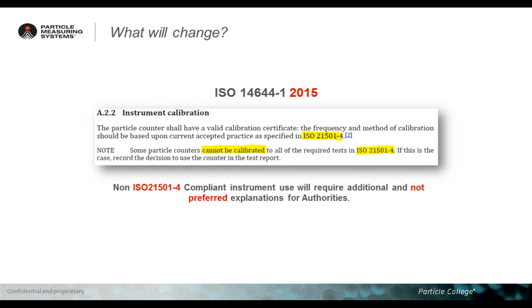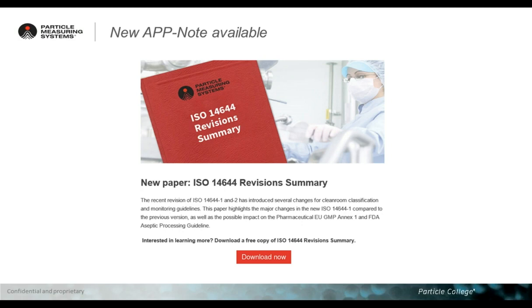As I said in these sentences at the bottom, the use of old particle counters may be allowed, but is of course not preferred. So make sure you align your instrumentation as soon as possible.